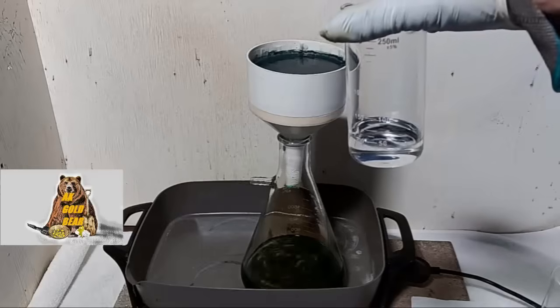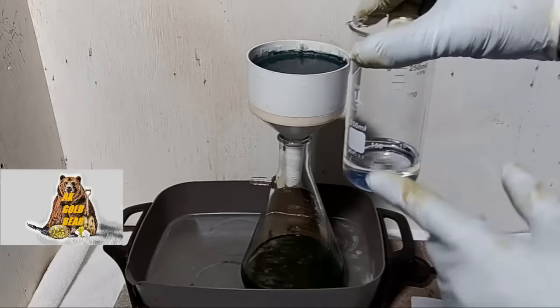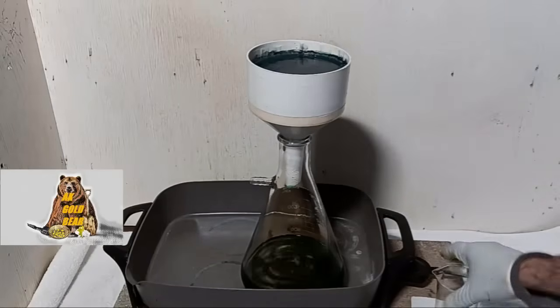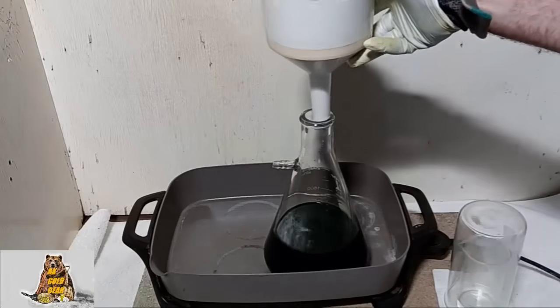I didn't use all the nitric acid — 50 ml left. I will use this acid to make aqua regia to dissolve all the gold flakes from this filter. Filtration is over.